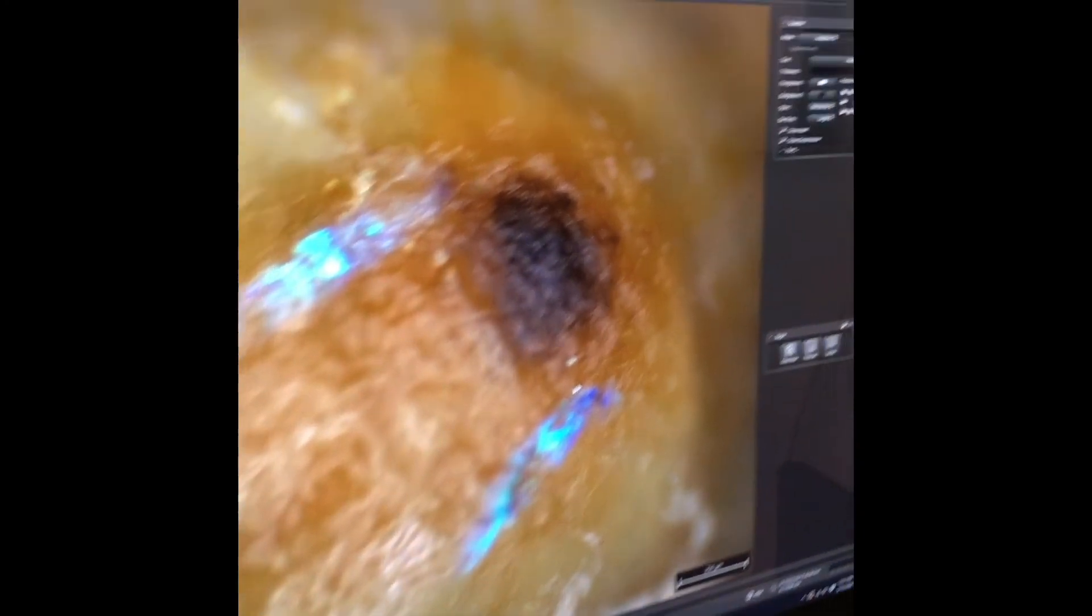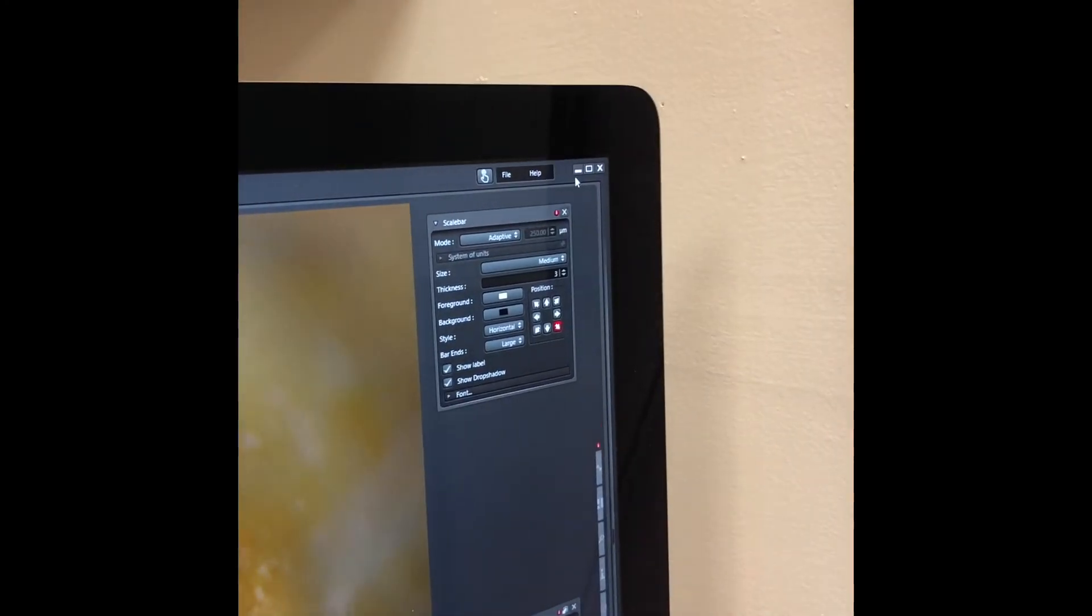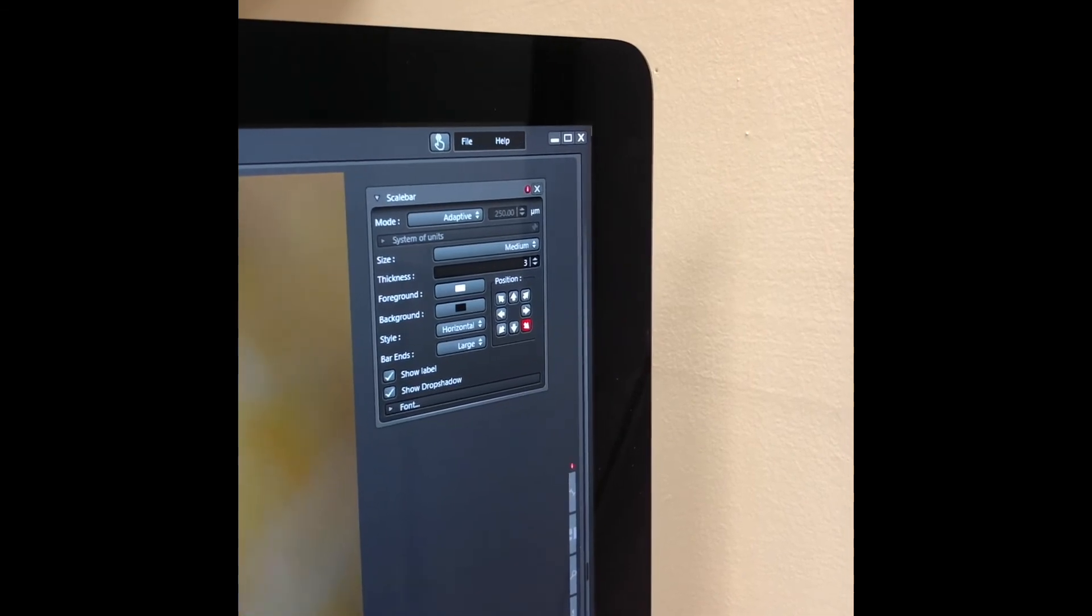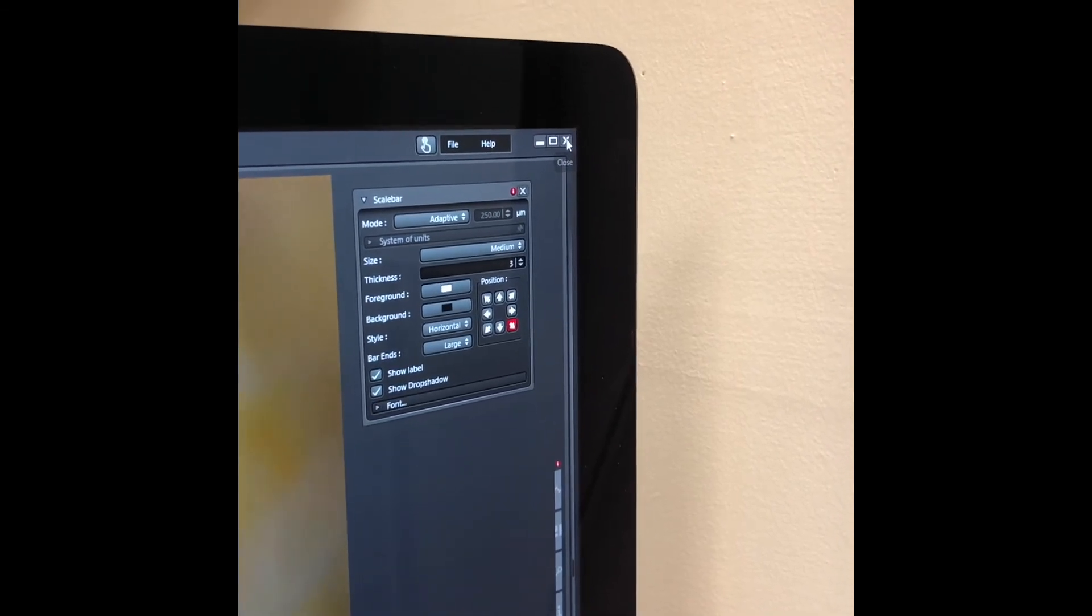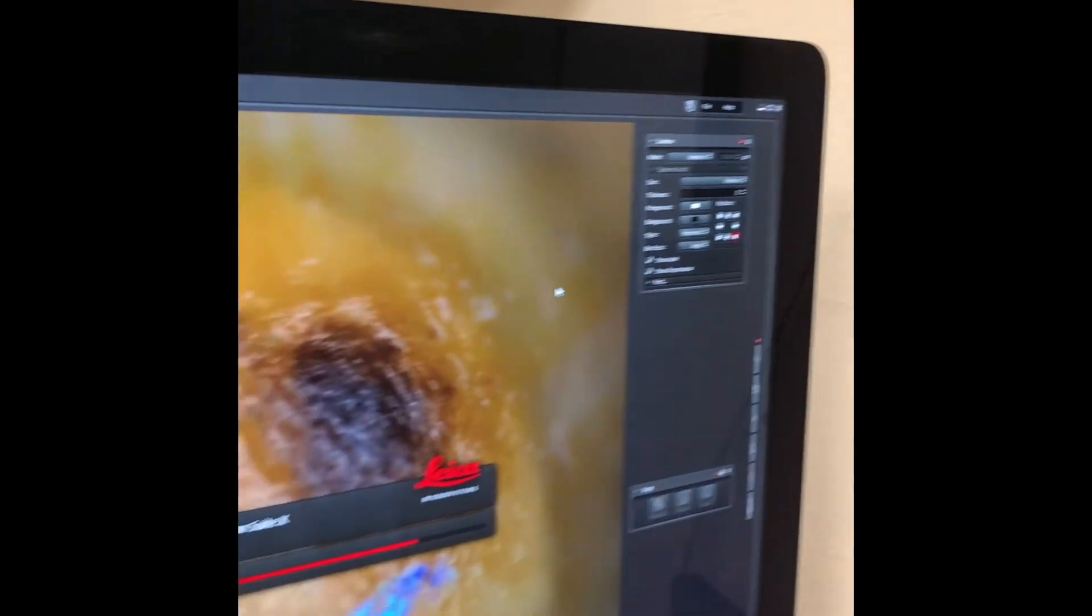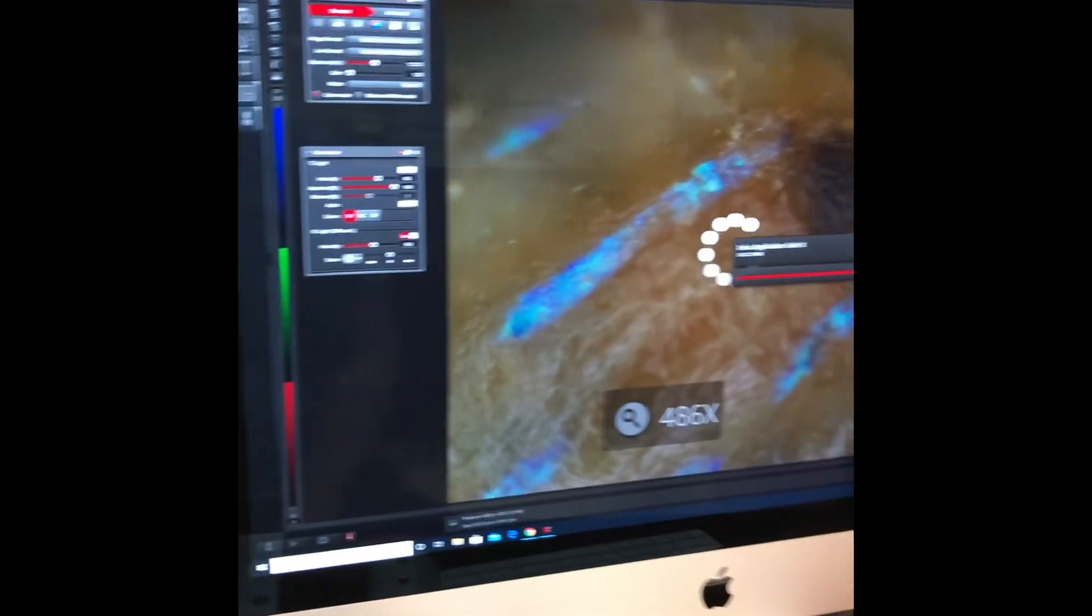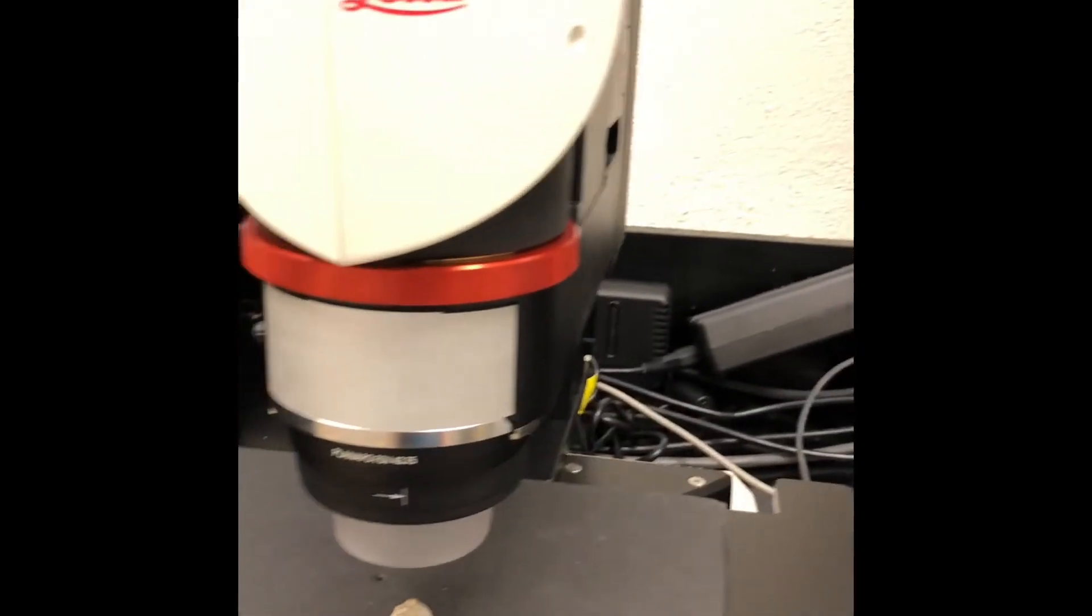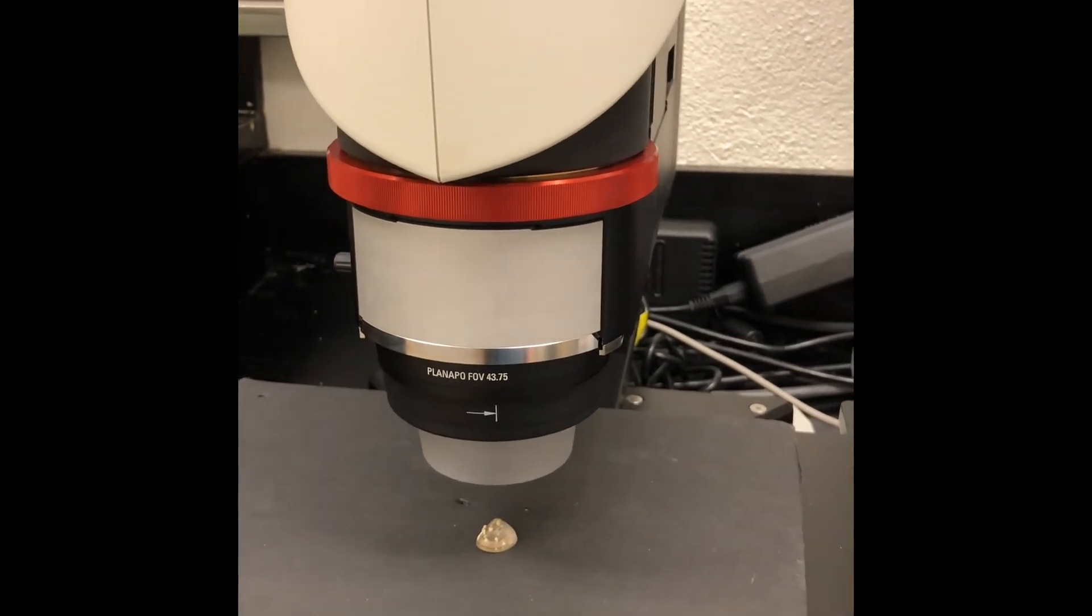Once you're done imaging, all you have to do to shut down the system is to close the software. And by turning off the software, you'll also turn off the light.